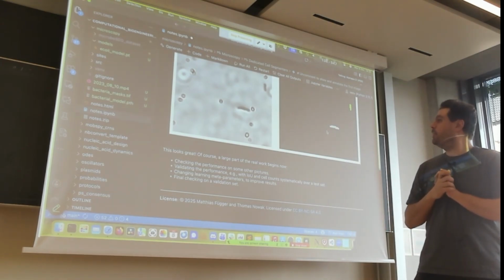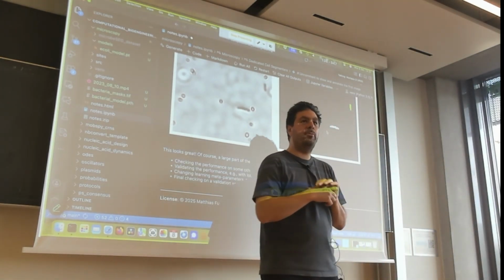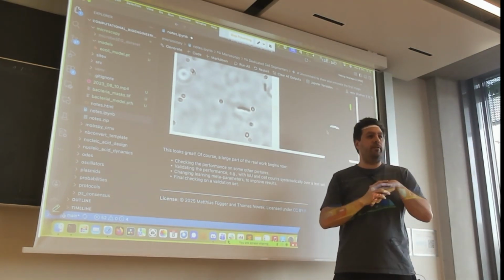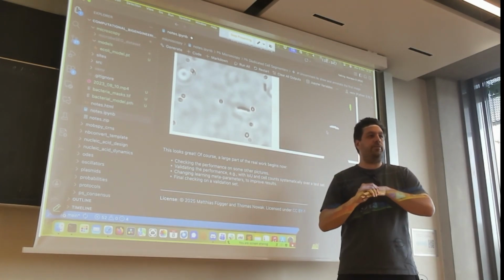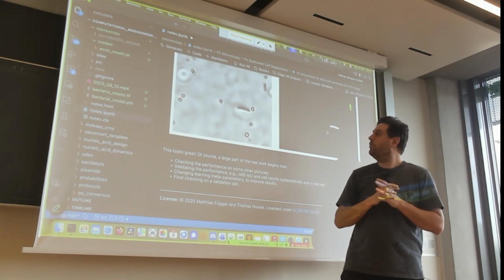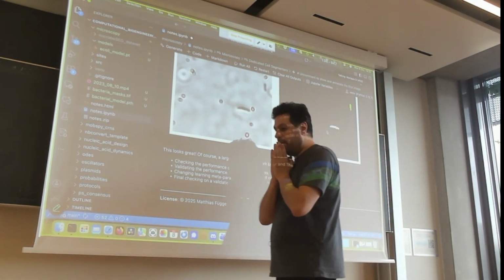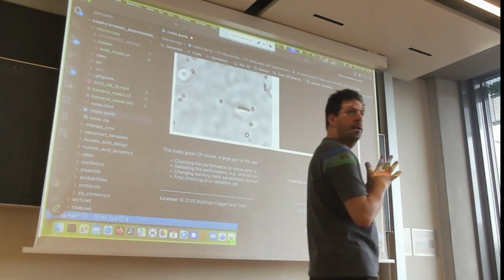Okay, but I think it has helped you to get a small glimpse into what to do with microscopy, from super simple classical algorithms like watersheding and pixel reductions, to more complex segmentation software, general software, to even more specialized cell segmenters, and to training them. And in the problem session, you will actually train it. We're discussing an interesting perspective of what to do if you have few data.